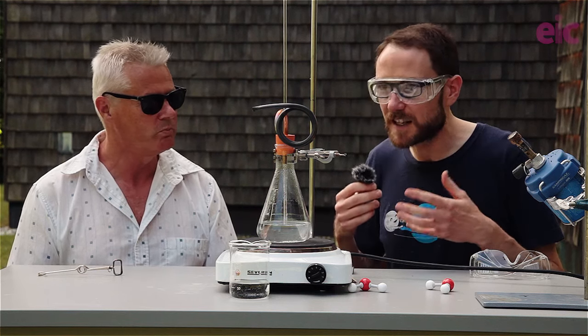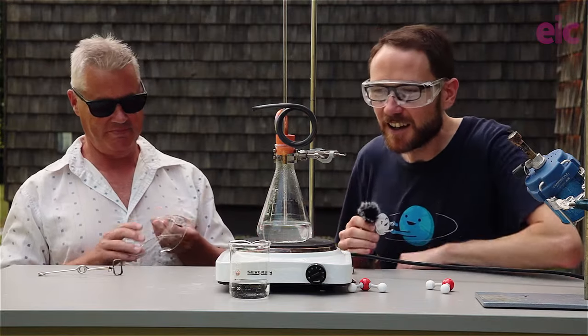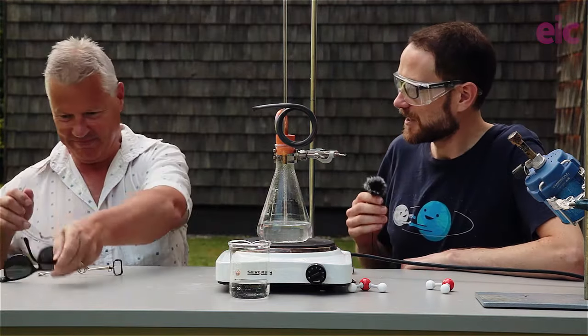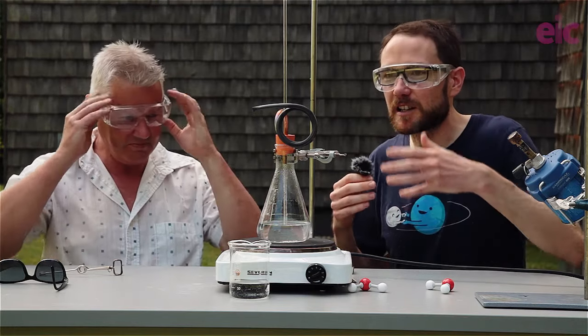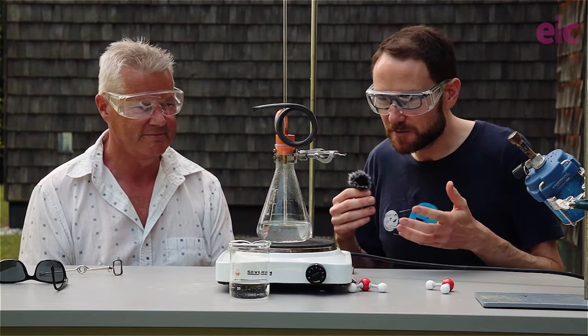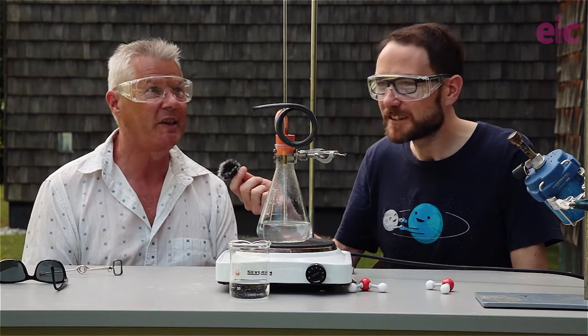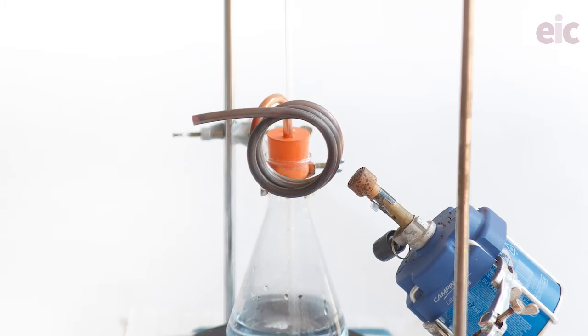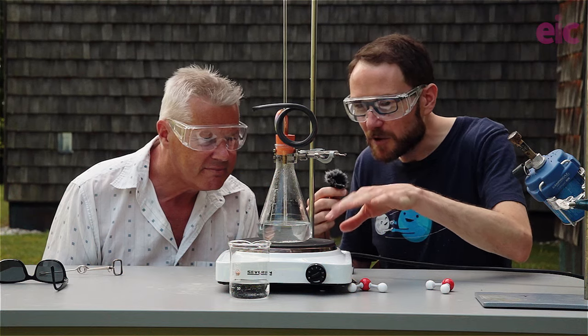So before we get into things, we'd better pop on some eye protection. Looking good, buddy. Okay, and we want to first of all just have a little talk about what we have up in front of us. Malcolm, do you want to just briefly describe what you can kind of see around you and what's going on? So there's a beaker on a hot plate, and a copper tube coming out of the beaker, and a big glass tube going up much higher, and there's some white stuff in the beaker.